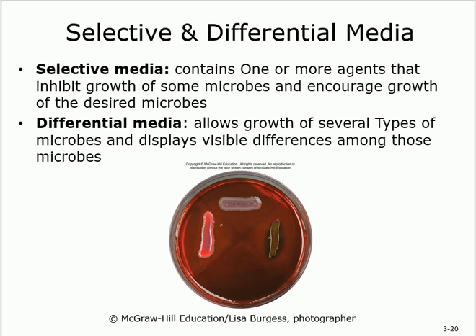The next type of media is called differential media. And to remember differential media, it's the one that will show you the difference between organisms. Differential, difference. So it shows you the difference. This is a media that is produced in a way to allow you to differentiate.